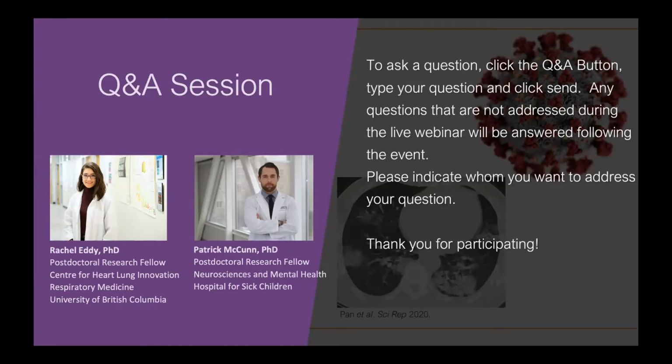So part of that is the development of basically an imaging cassette, which would be isolated from the surrounding environment, such that you could still use isoflurane and exhaust the gas out, but put a HEPA filter in between to allow the virus to be contained. So that's something that we're actively working on.